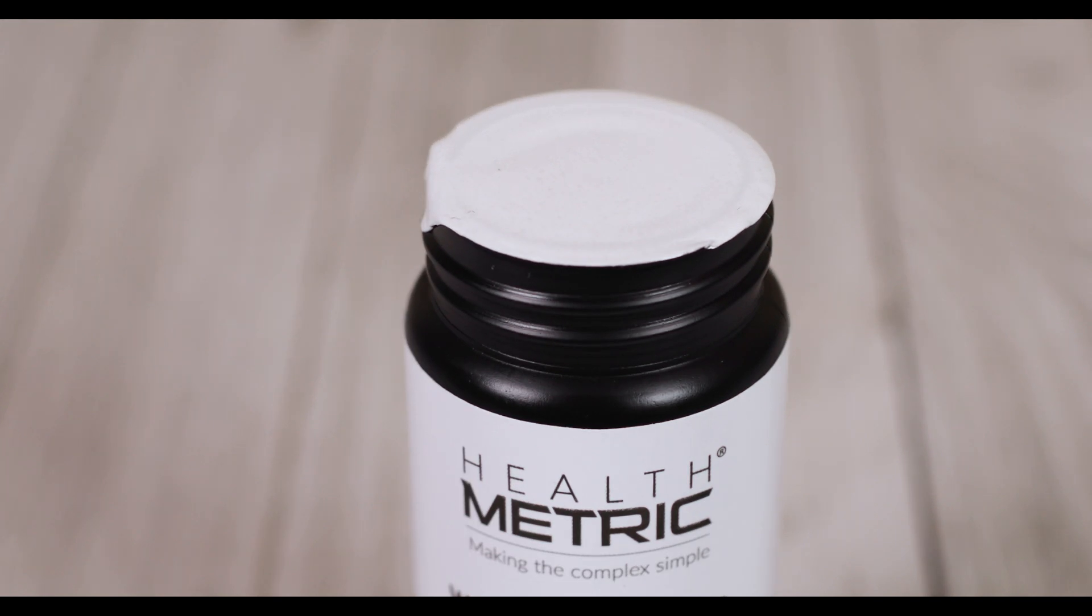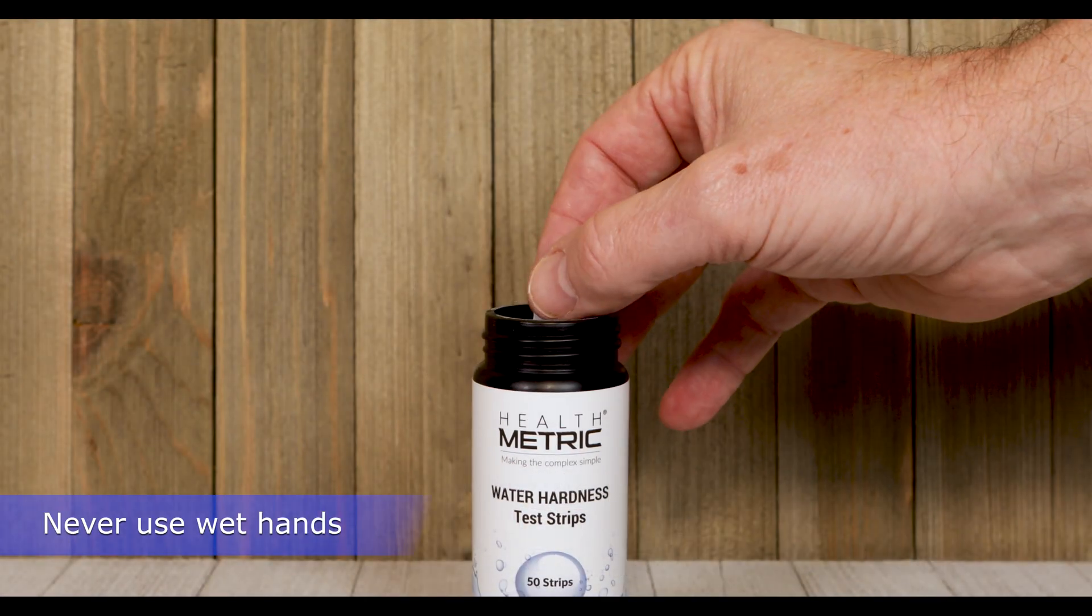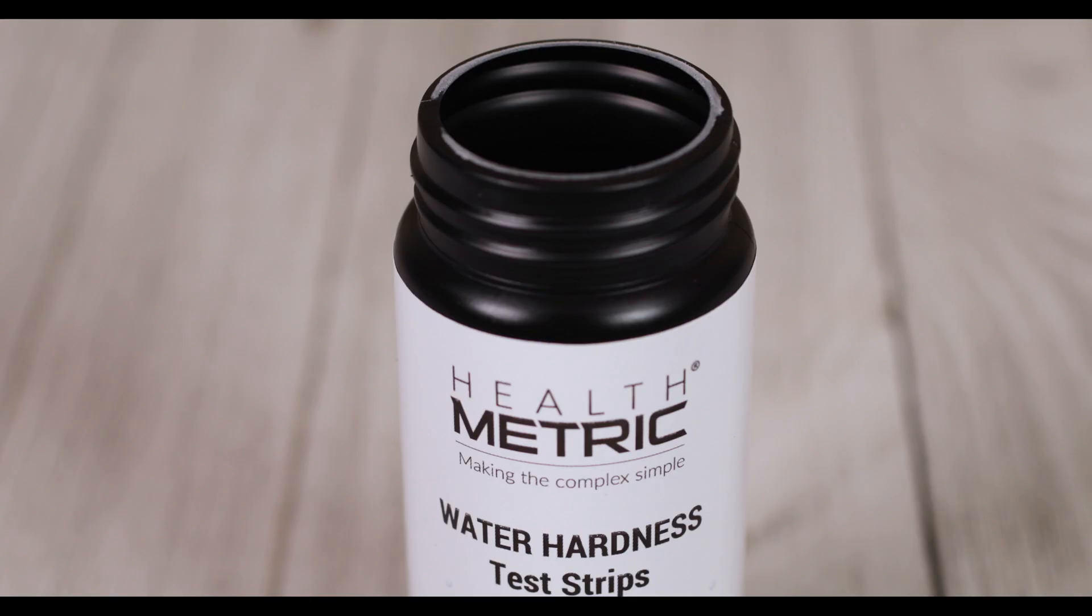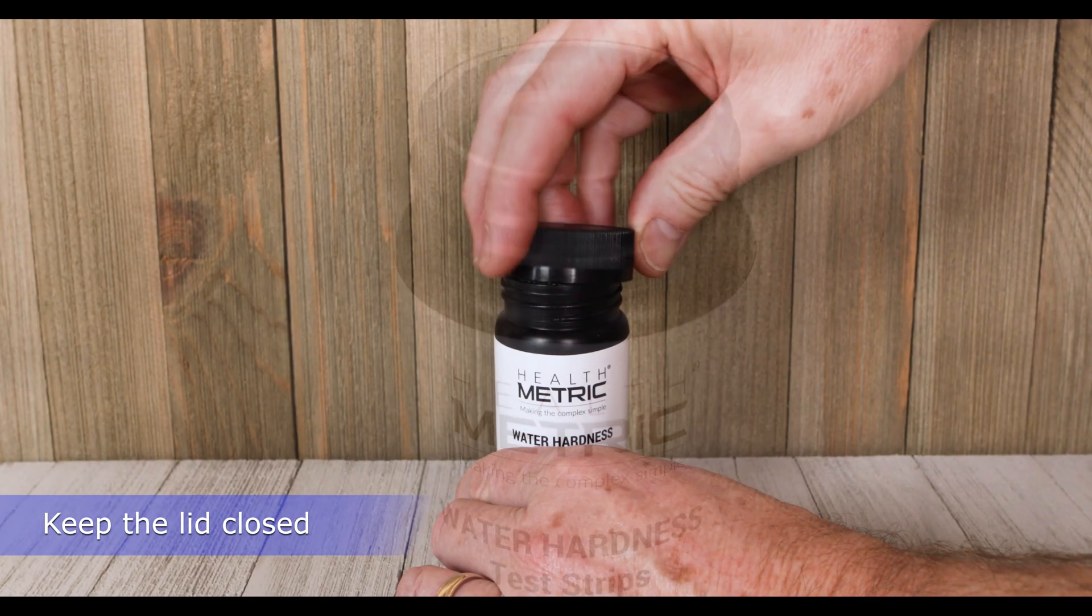The jar is factory sealed to keep out moisture. Never use wet hands when removing a test strip from the jar. Remember to keep the lid tightly closed when not in use.